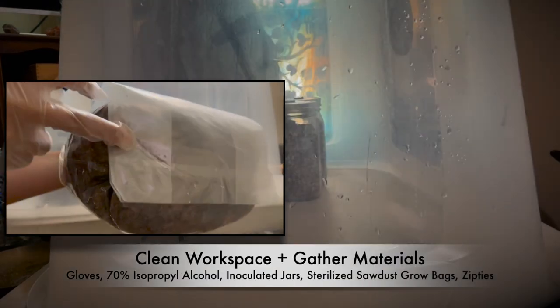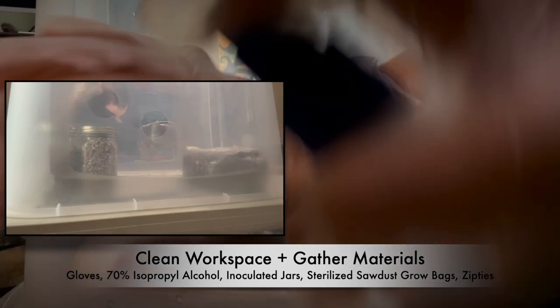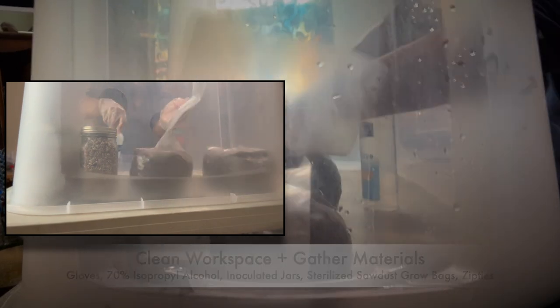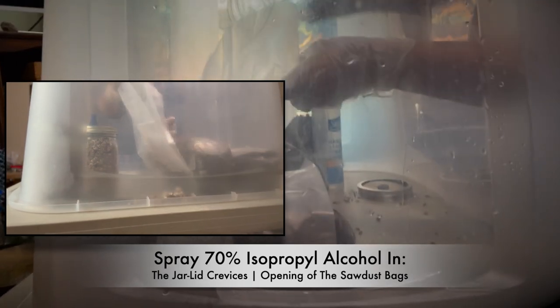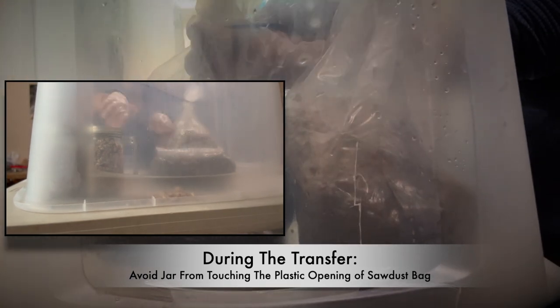Let's do a jar to bag transfer. Wear gloves, sanitize everything, and gather your materials: your rye grain jars, sterilized grow bags, alcohol, and zip ties. It's important to sanitize the crevice between the lid and the glass jar, and also sanitize the opening of the grow bags to make sure everything is as clean as possible during the transfer process.